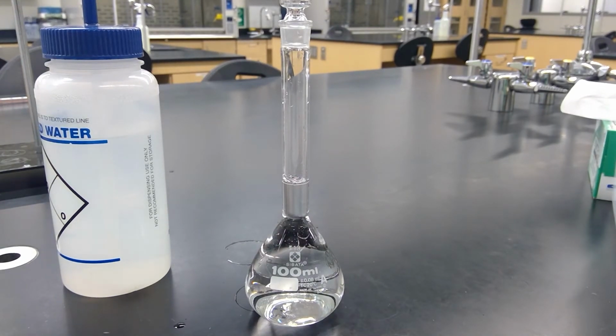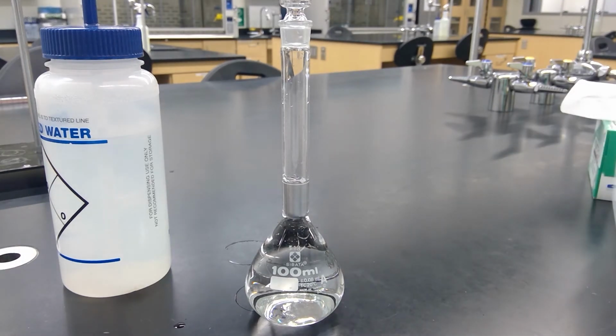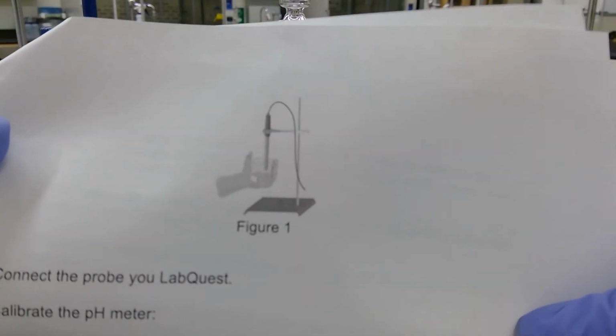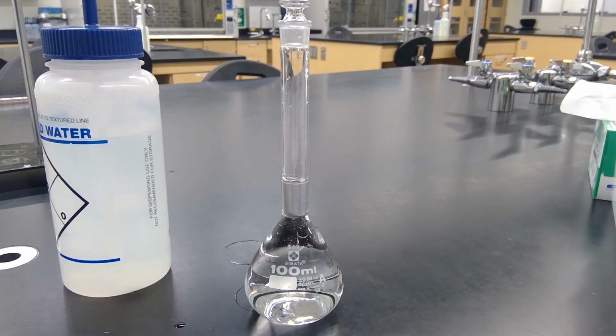Use the utility clamp to secure a pH sensor to a ring stand shown in figure 1. So, you should be following along, but this is figure 1. So, I have that ready off to the side.